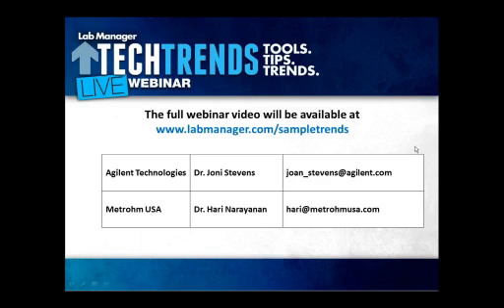Hari, I had a follow-up on the automation techniques that you described. When do you see automation as a growing trend in sample prep, first of all? And if it is, is there anything that people should consider when looking to automate? Is there a certain throughput threshold, or is it very sample and application dependent? What are your thoughts on that?